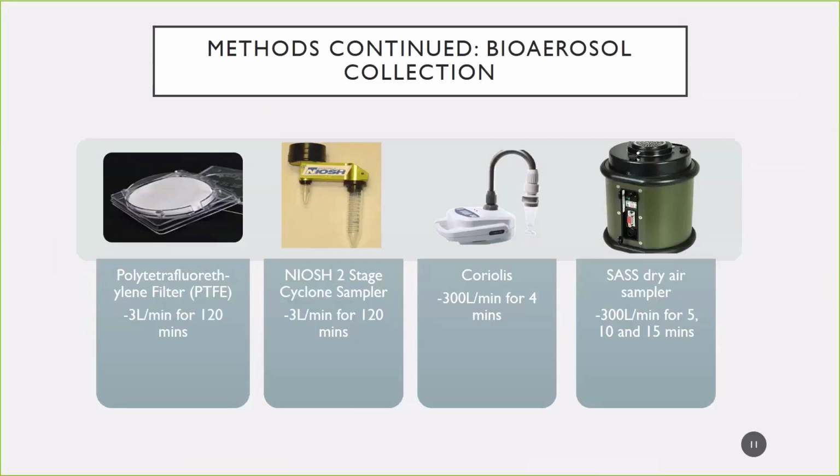For our bioaerosol collection, we used 4 different collection devices. The 2 on the left are a PTFE filter and a NIOSH 2-stage cyclone sampler. These are our low volume samplers, where we sampled at 3 liters per minute. The 2 samplers on the right, the Coriolis and the SAS dry air sampler, are the large volume samplers, where we sampled at 300 liters per minute. Next slide.